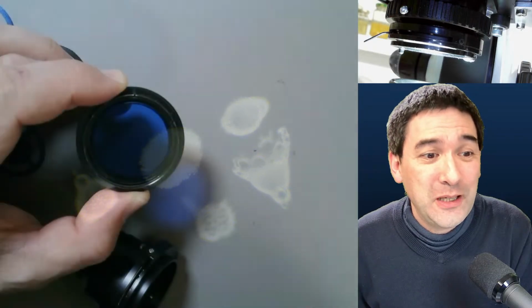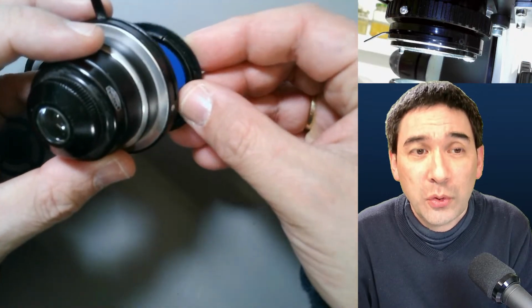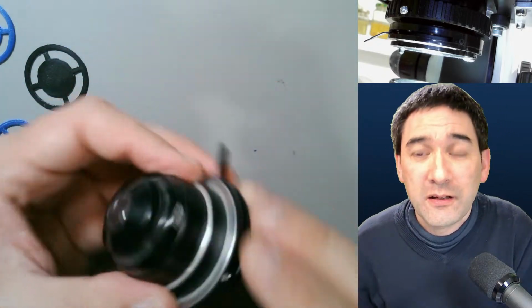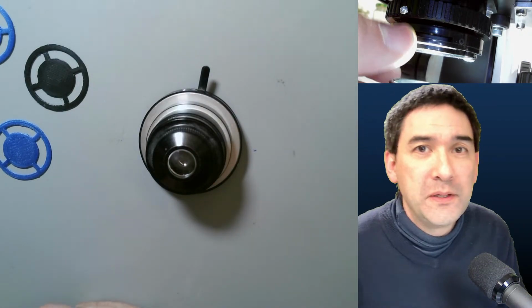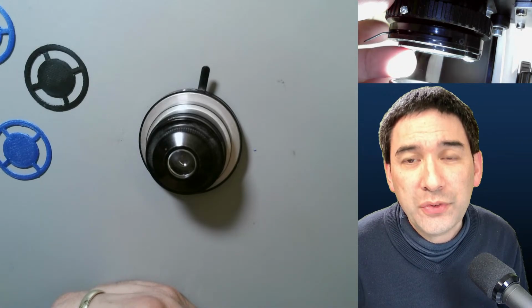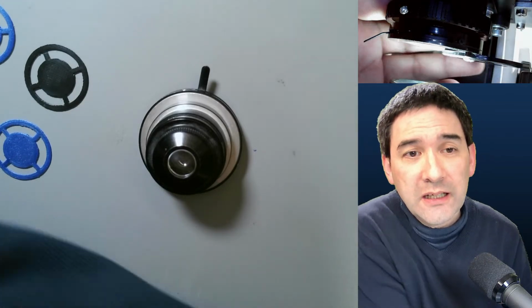Many microscopes also have a so-called swing out filter holder, where it's not push on like over here, but rotates out like this, and that's what I have on the top here. This is not the microscope that I normally use, but a different one that I set up. It's a relatively decent microscope, the Swift SW380T. I've already made some review videos about that. You now see a little plastic filter holder that you can rotate in and out. Currently I placed a dark field filter in here, and I'm just going to take it out, and here it is.